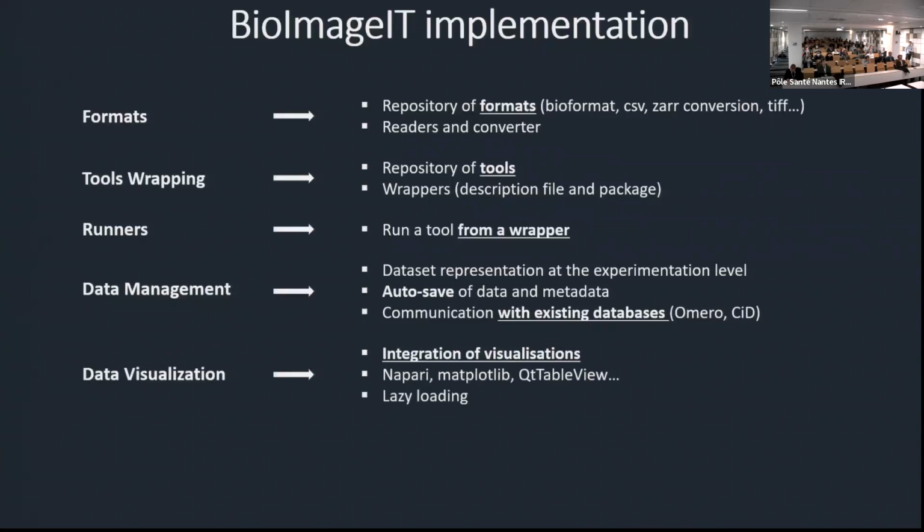About the visualization, the visualization is integrated also in the graphic interface. So we can use Napari or Matplotlib or QTable depending on your data. And the last one is the data interaction with the reading of the annotations.